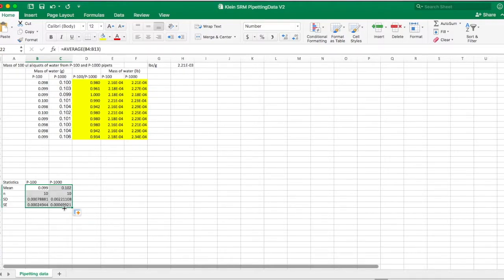Now convert your calculations to the appropriate number of significant figures. A good rule to use is the least number of significant figures within the calculation determines the number of significant figures in the answer. Make sure the final answer is not more accurate than the instrument with which you made the measurements. The lab manual explains some other rules for determining significant figures.